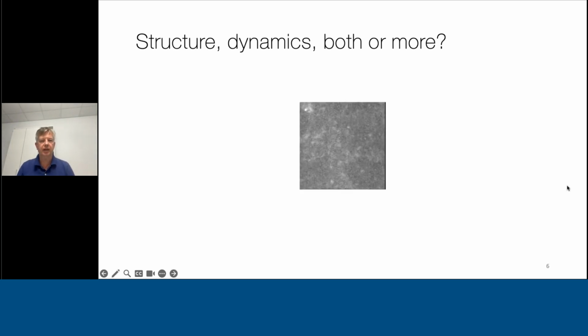If you take a look at that picture, what you see here is a peptide which is labeled, binding to a lipid bilayer. And if you look at that, perhaps you see that the lower right corner is a little bit darker than the rest, and you see a little bit of structure, but that's about it. But once I start the recording, then you see the dynamics.